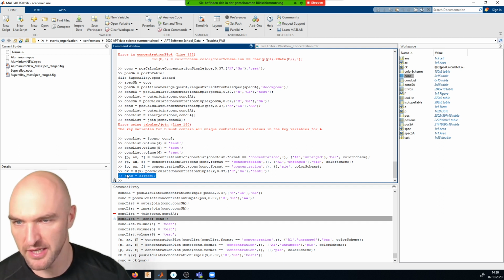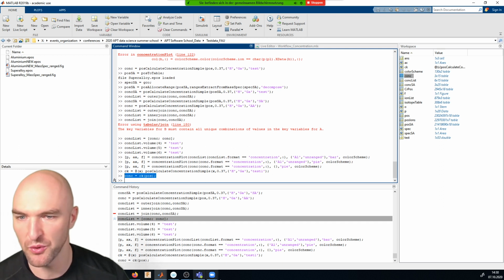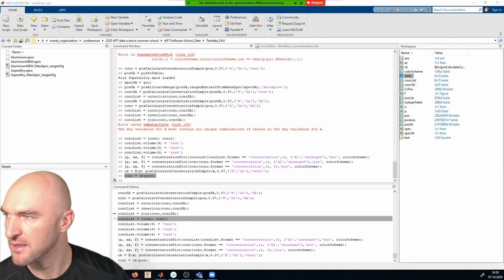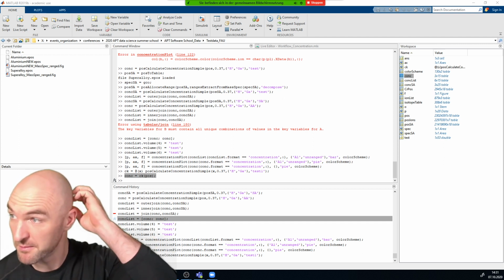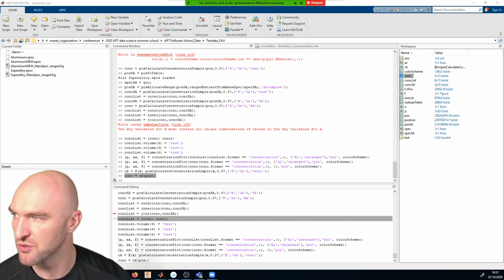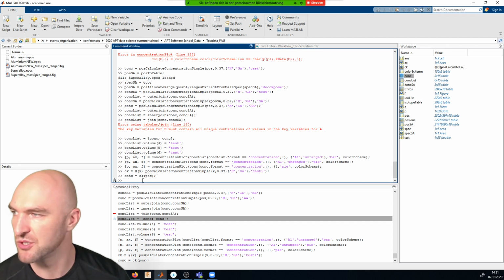With that, we're actually going to stop with the concentrations here. And what I want to show you next, just quickly, is a little bit about spatial visualization. We're going to mostly start spatial visualization tomorrow, but there's quite a few things to it. That's why it's maybe a good idea to take the couple of minutes that we still have left for the concentration calculation session to do that.